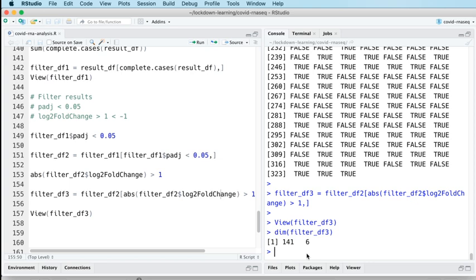We've also looked at some standard plots which DSeq2 gives us access to. So DSeq2 has its plot PCA function, which actually uses ggplot2 to produce a principal components analysis plot, which we've done a few times now. And yesterday we met plotCounts, which is another DSeq2 plotting function, which allowed us to produce a little scatter plot according to condition of the counts for a particular gene.